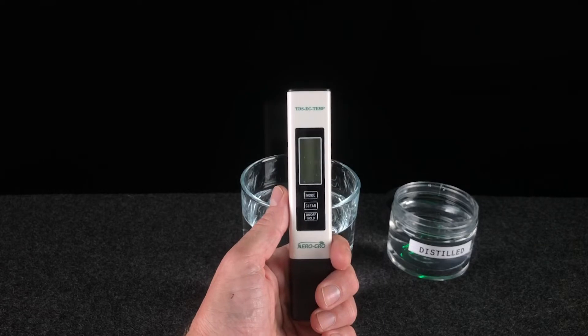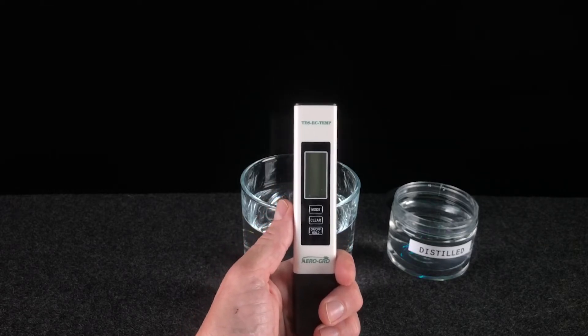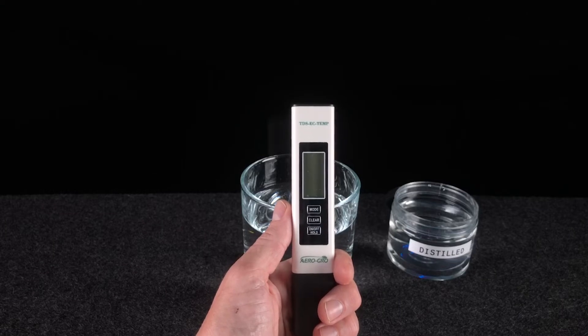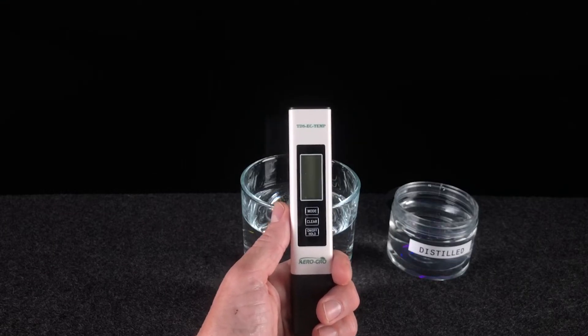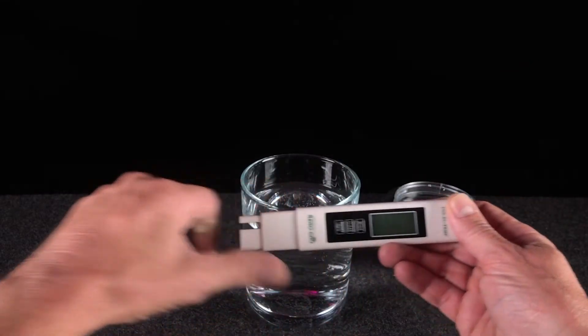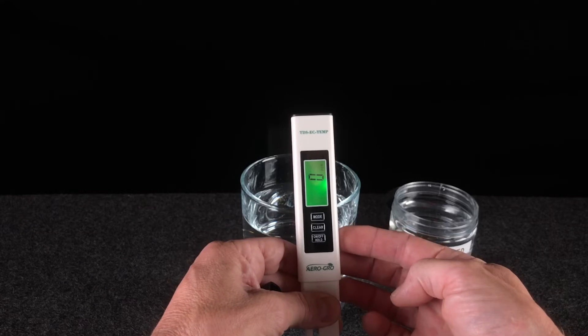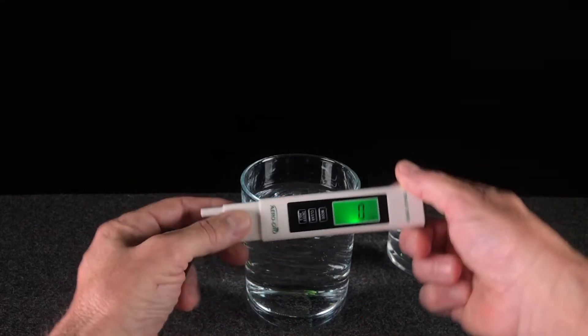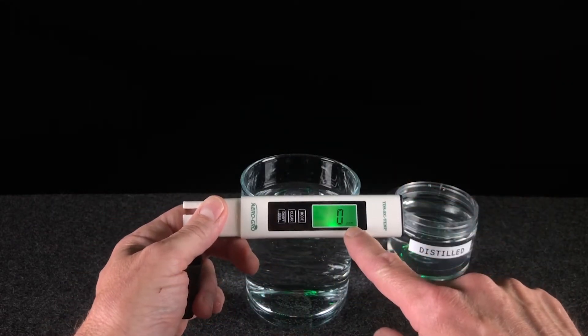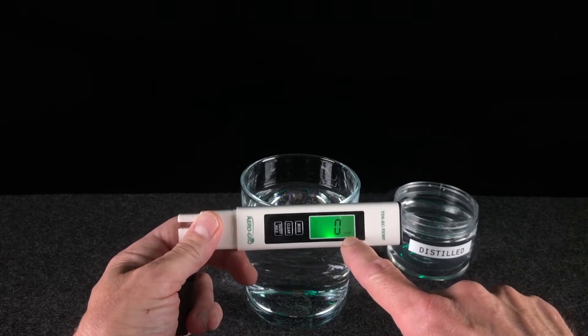The other half of your meter set contains the TDS EC temp meter. This meter will measure total dissolved solids, electrical conductivity, or temperature. Begin the same way by first removing the cap, turning it on, single-clicking the on-off button. You'll notice that when we first begin, we are in TDS mode, which is measured by parts per million, as you can see on the bottom right.